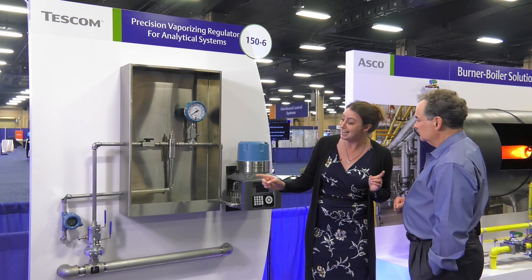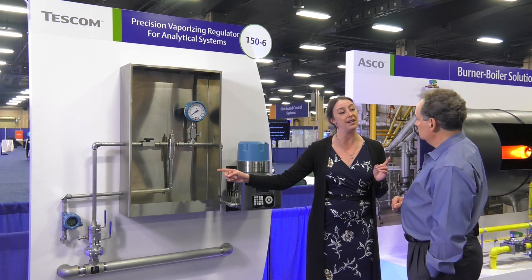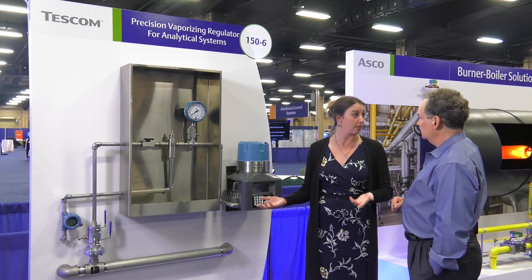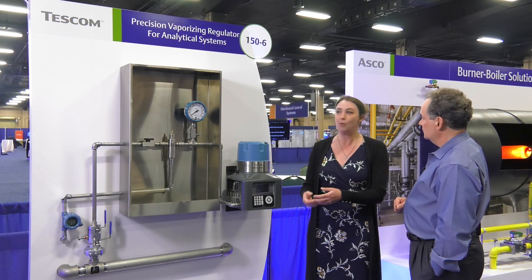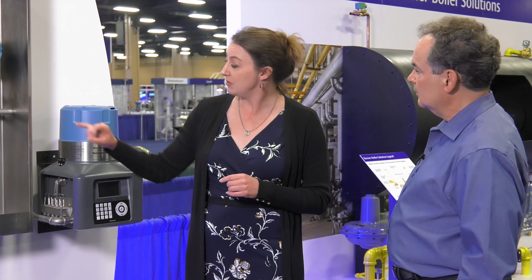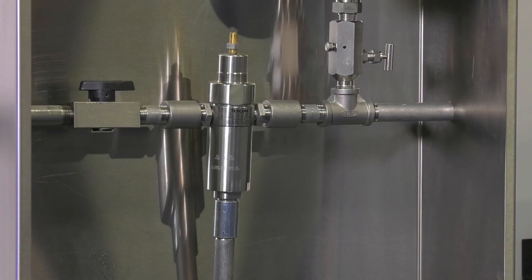The other thing that allows is the transmitter can always sit outside the cabinet, allowing operators and technicians who walk by to see that the vaporizing regulator is delivering the temperature it needs to without opening the cabinet. The transmitter also offers a 4 to 20 milliamp output that you can run back to your DCS system and see from your control room, so you've got remote visibility into exactly what's happening in your sample conditioning cabinet. One other thing we've added on the safety side is a thermal cutoff — a secondary thermal cutoff — so that if there's any thermal event, it will shut down power to that vaporizing regulator, ensuring safety for all.